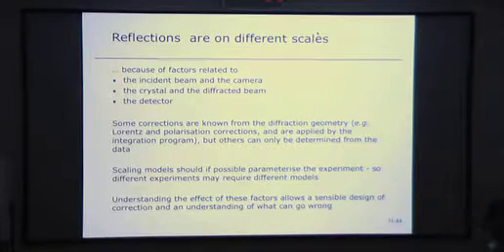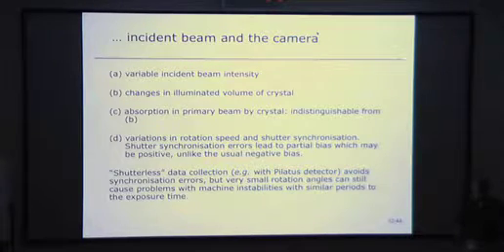And that's where the expertise of the programmer for the scaling program comes in. And then the last point, understanding the effect of the factors can give you a sensible design of the scaling program.